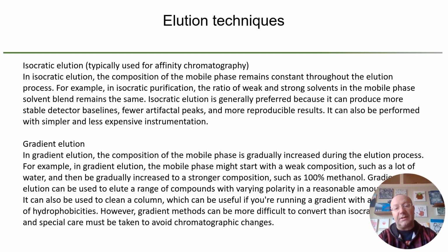We've used it in class with our pH change, and everybody now by this time has seen how the peaks come off from protein A antibody elution.